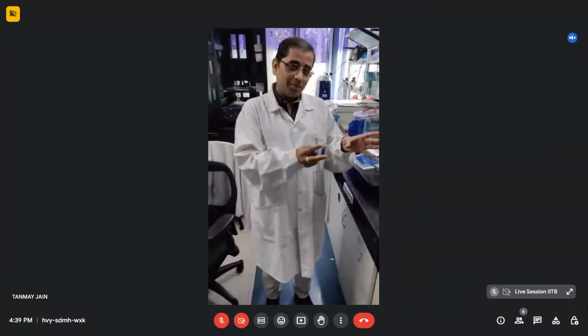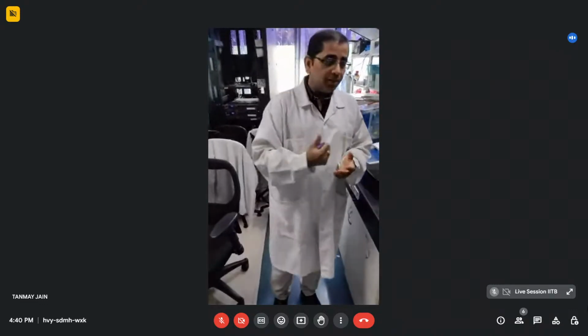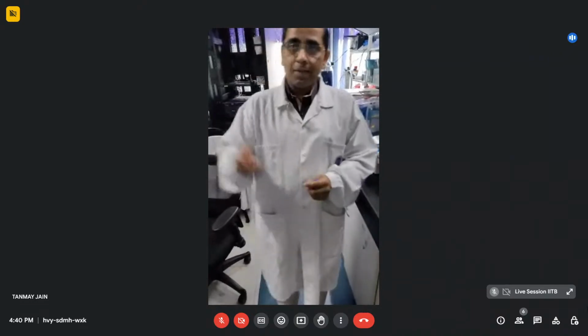Can you directly take them? Probably not, because we are still talking about the protein. And to run them on the mass spec, you need to digest them and make them peptides. So the next exercise which we are going to talk to you about is protein digestion, both in-gel and in-solution based activity, which I will explain to you briefly.